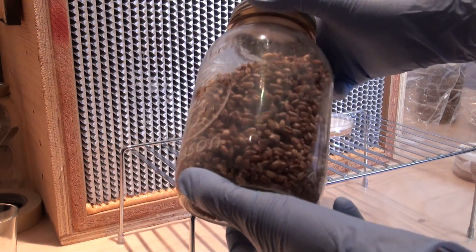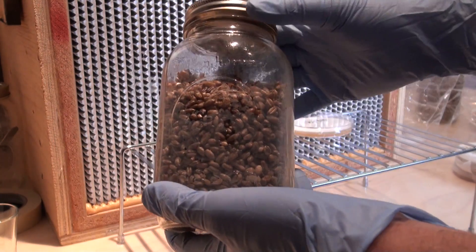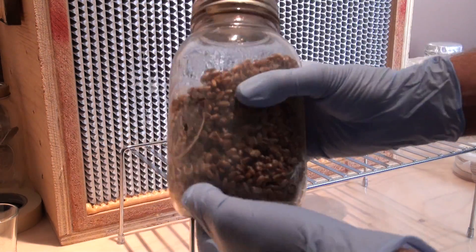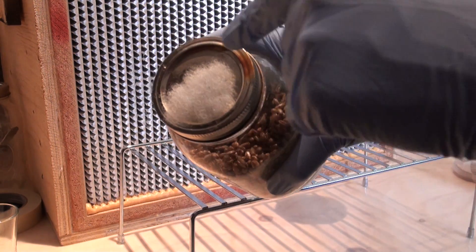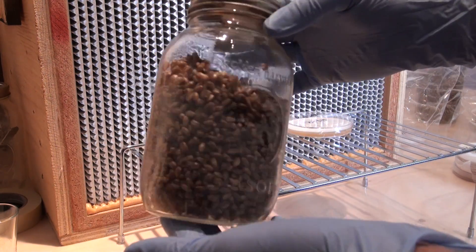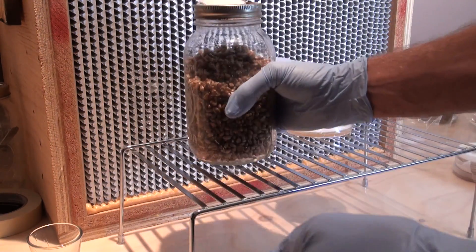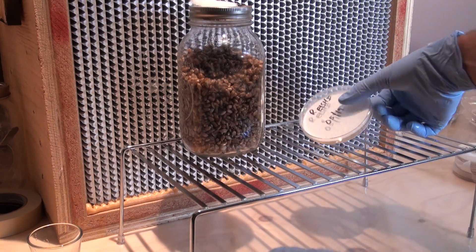This is the jar of sterilized grain that we made by preparing the grain, hydrating it, and then sterilizing it at 15 psi for 90 minutes. This jar has a filter lid — pretty much just a hole drilled into the top of the lid with some poly stuffing in it. So this is 100% sterilized grain which is ready to be inoculated with the mushroom culture. I've got my reishi mushroom culture set up here as well.